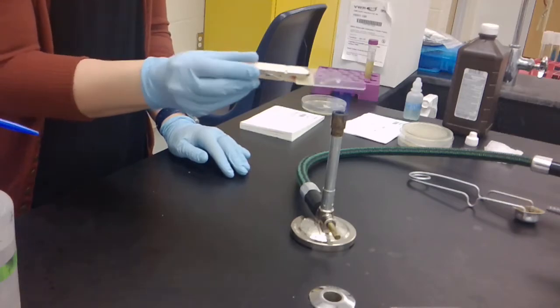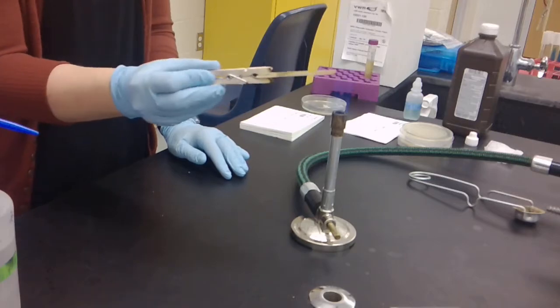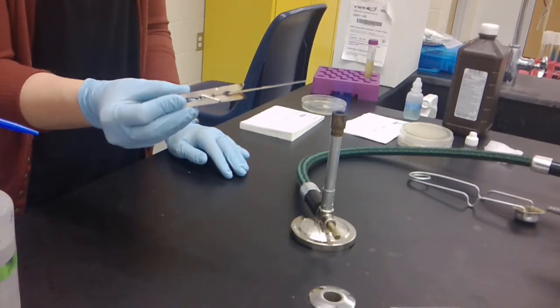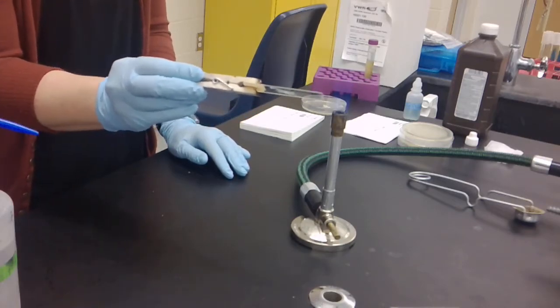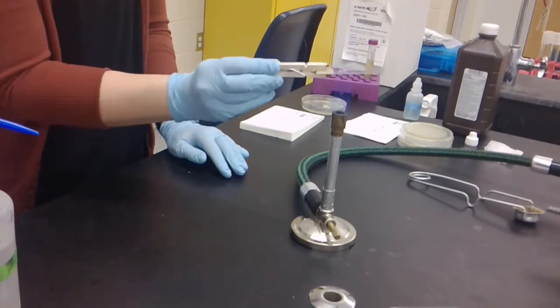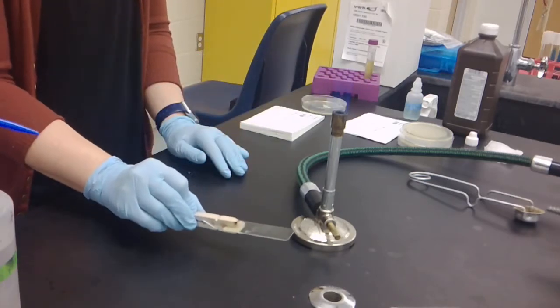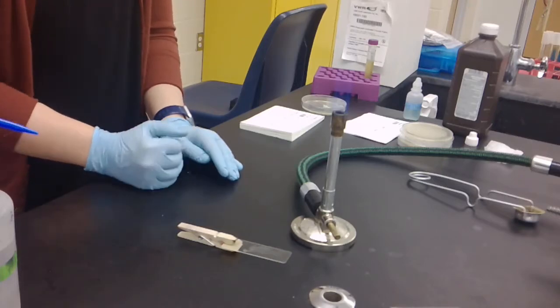When you heat fix your bacteria, you don't have to let the whole entire water droplet get dry. As long as you can see dried bacterial suspension on your slide, enough for you to stain, you can move ahead with your staining procedure. And after enough of your bacteria has dried, you can set your slide down and let it cool for a few seconds before proceeding with your staining.